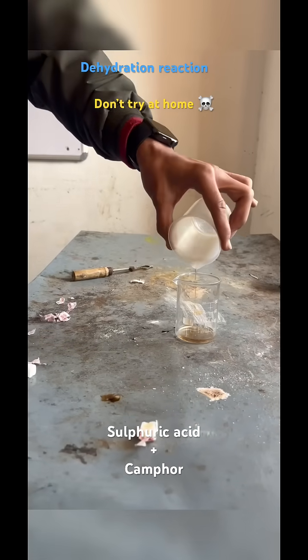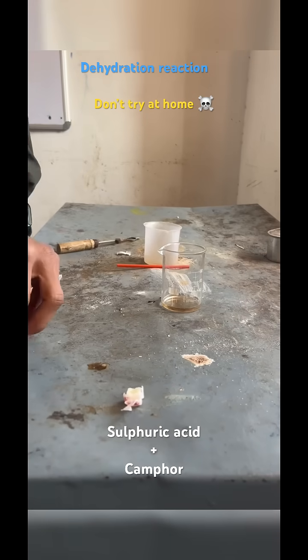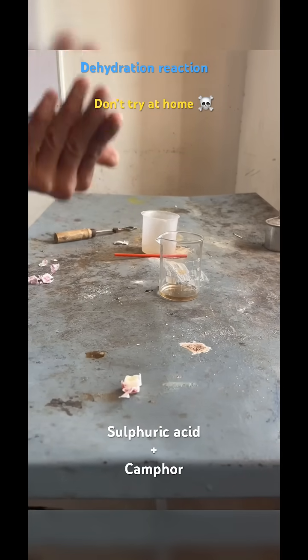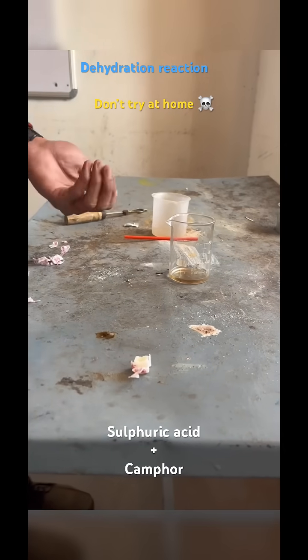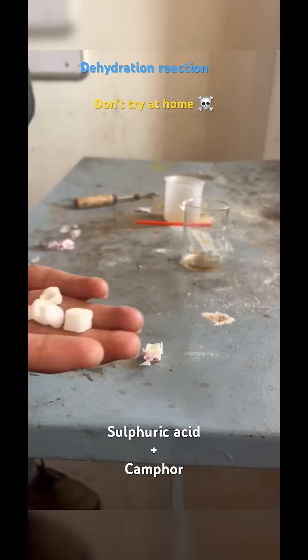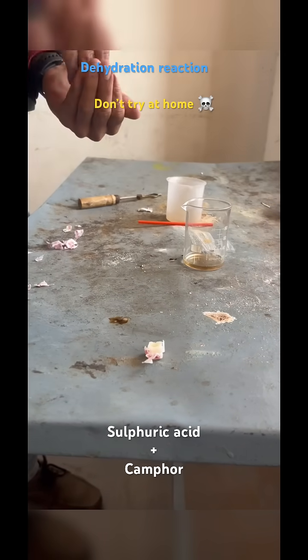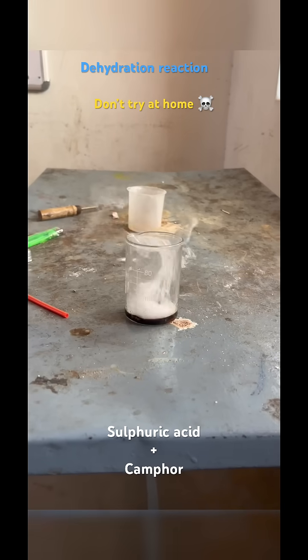Hello students, welcome back to my YouTube channel. Today we have some concentrated sulfuric acid which is acting as a dehydrating agent. We are adding camphor into this — these are the pieces of camphor we are going to add into the concentrated sulfuric acid.